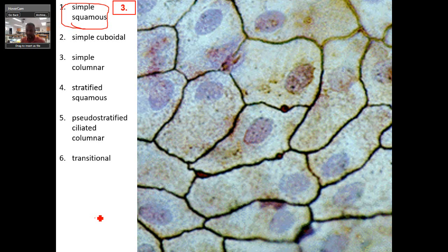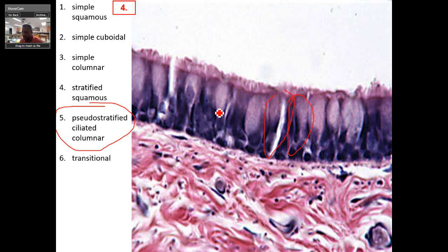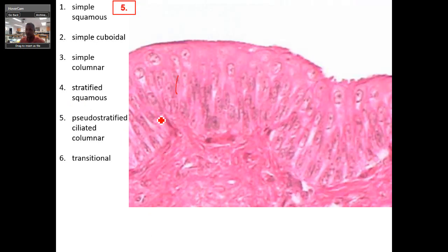So that's what I mean by the speed round. These are cilia. It looks like a bunch of layers, but it's actually one layer from here down to here. That's a cell, that's a cell. Look at the nucleus for this one and then look at the nucleus here. Dispersed in between might also be goblet cells. Next one — this should be transitional. Look at the layers, but then you see the different dome cells there.